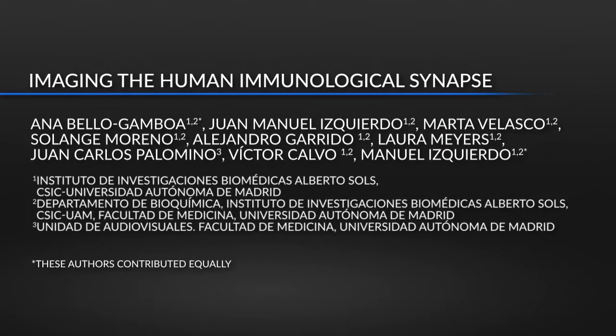The purpose of the method is to generate an immunological synapse, which is an example of cell-to-cell conjugation formed by an antigen-presenting cell and a T helper lymphocyte. Our aim is to record the first stages of the immune synapse formation and to record the trafficking events occurring in the T helper lymphocyte. This eventually will lead to polarized segregation at the immune synapse.